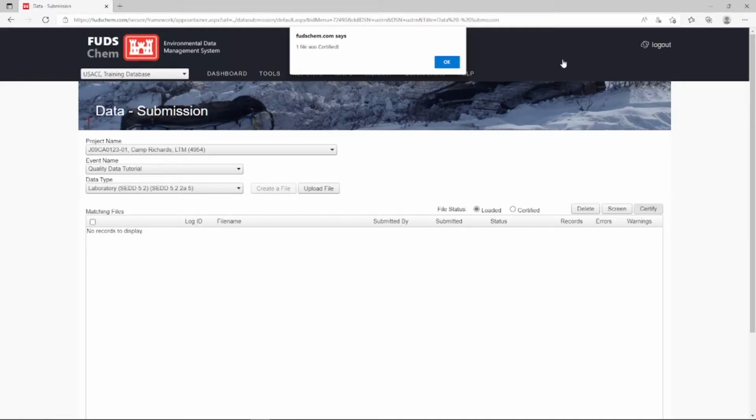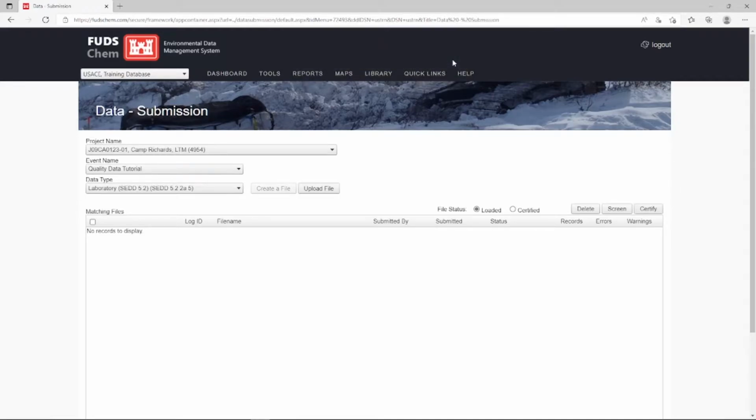Note that all applicable QCs must be included in the SED file to be considered by the ADR. If a trip blank applies to 10 samples, all 10 of them must be included in the same file. If 5 of them are broken out into a separate file, they will not be qualified based on the trip blank.